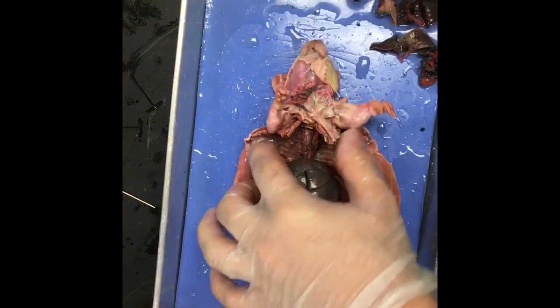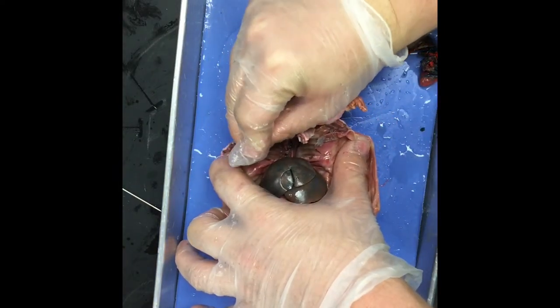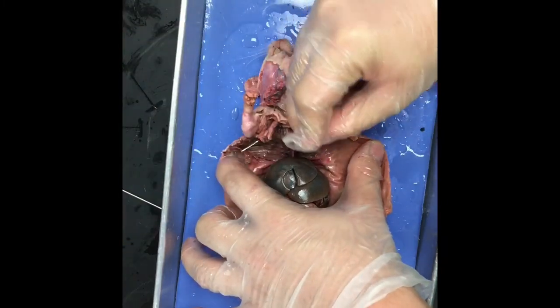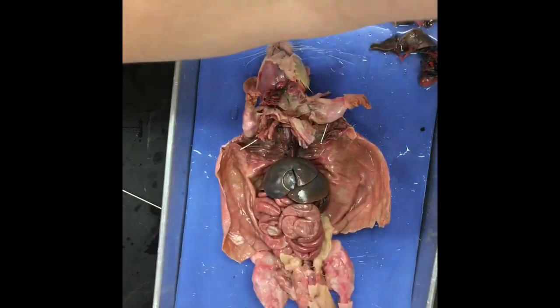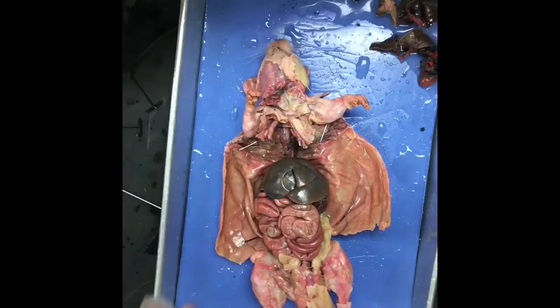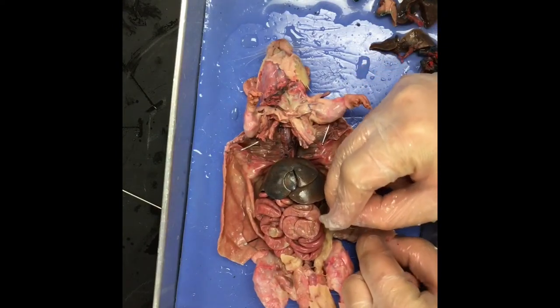Aren't rats' ribs almost entirely cartilage? Yes. Because it allows them to squeeze through holes easier. Survival techniques. All right. So there are your pins. These are to hold everything out of the way and in place as you take them apart.